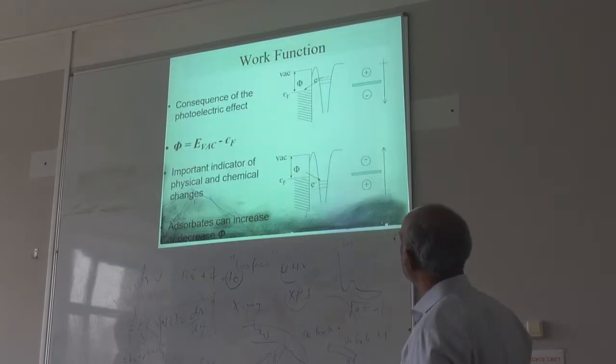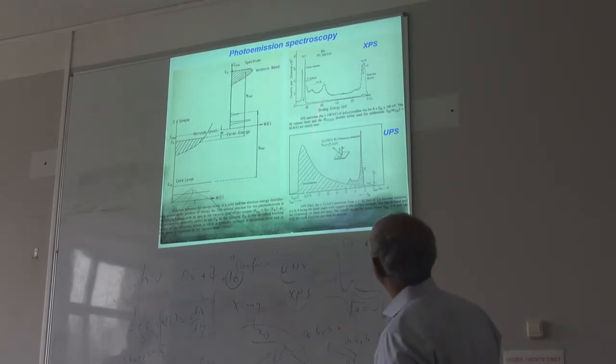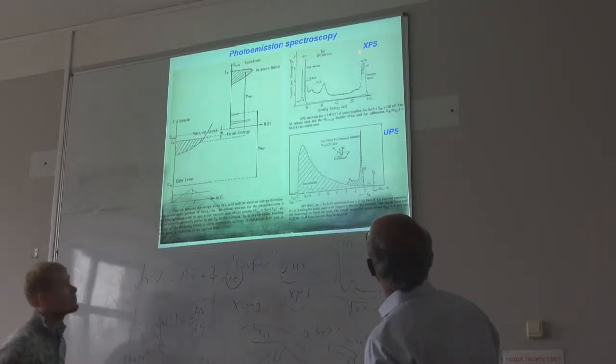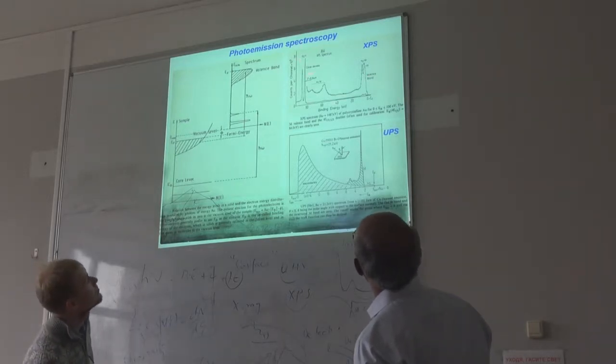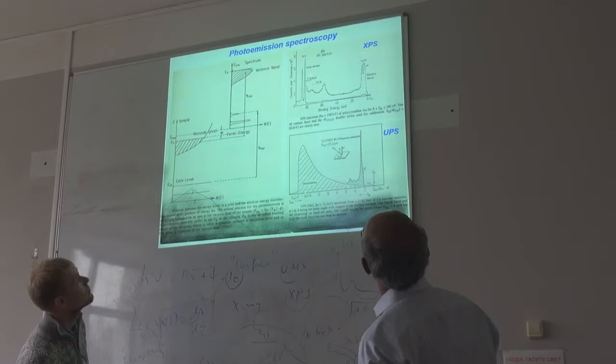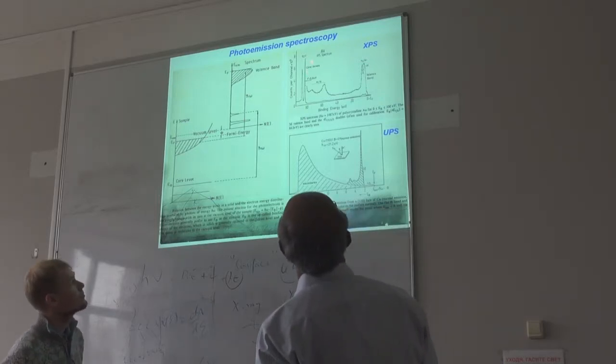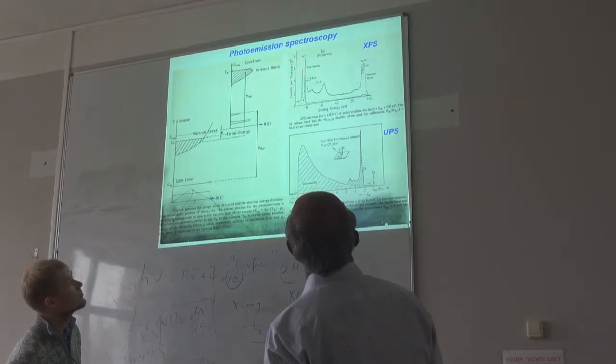If you look at any, here is some spectrum of the XPS. You can see different features coming from gold. This is all coming from the core levels, right? So even gold 5d, gold, this one, so L1 or something.